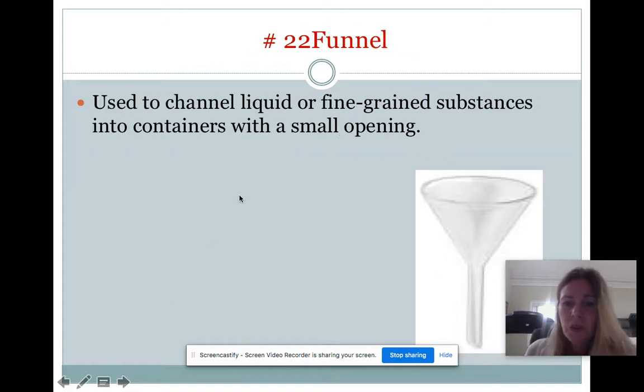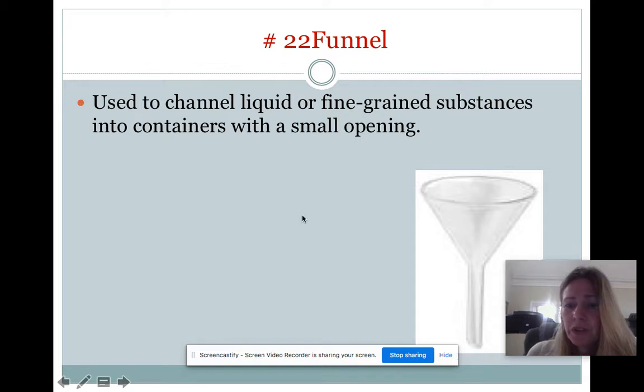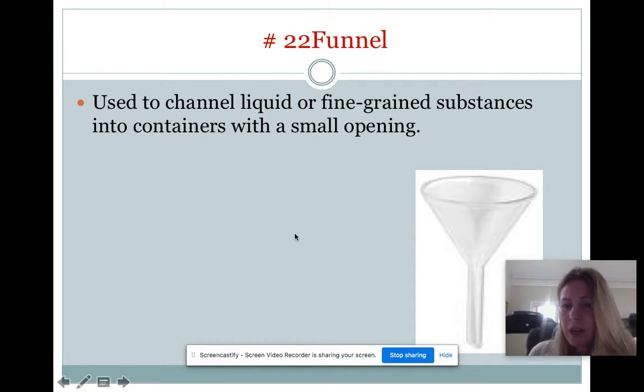So we'll be using some filter paper in order to use a funnel. In biology, it's a little bit different than chem lab, but funnels are usually used for separation purposes. Usually you use either filter paper, which almost looks like a coffee filter, where it lets liquid come through and the solid stuff stays in, or cheesecloth, or something along those lines, which filters out large particulates.